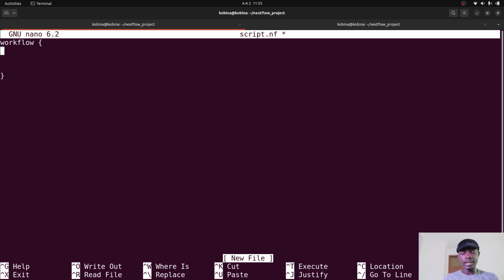Everything here will be executed for us. So we need this keyword first. This tutorial is a simple one, so all that we are going to do is read the file first.